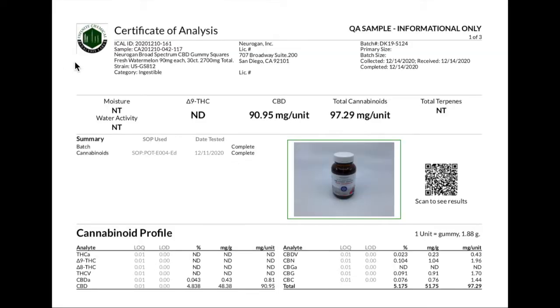Today we'll take a look through an expanded cannabinoid profile for Nuragin's 90 milligram THC-free broad spectrum gummy squares. Once you're looking at the COA document, look in the top left header. Confirm the name of the product and the strength. In the top right column on the header, view and confirm the lot number under batch number.